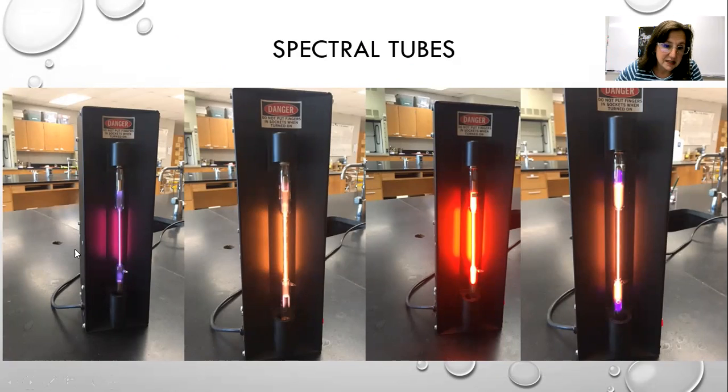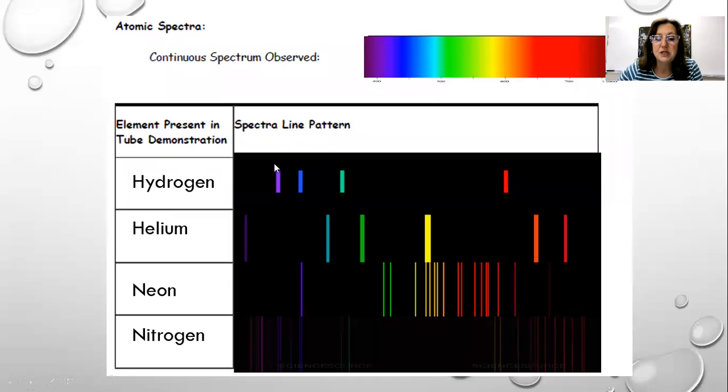Look at this one, for instance, hydrogen, almost this pinky color, right? It breaks it down into the particular line spectra that we see that can be associated with those very specific energy levels that electrons can exist in these particular elements. So these are like our fingerprint patterns for these elements.